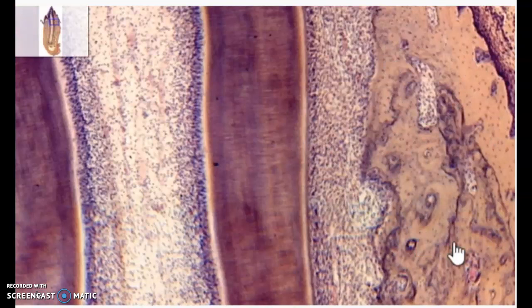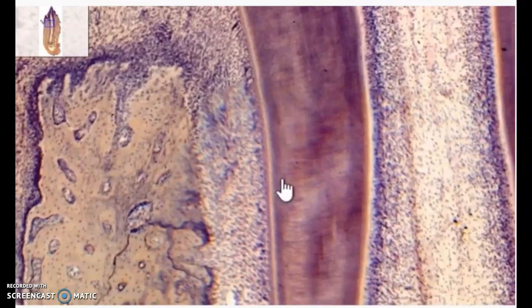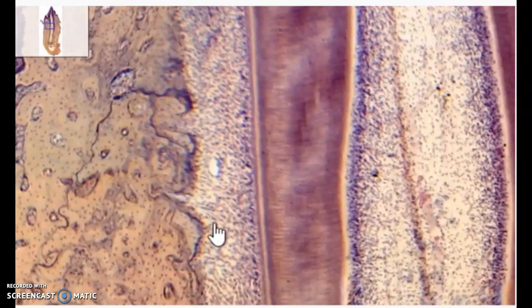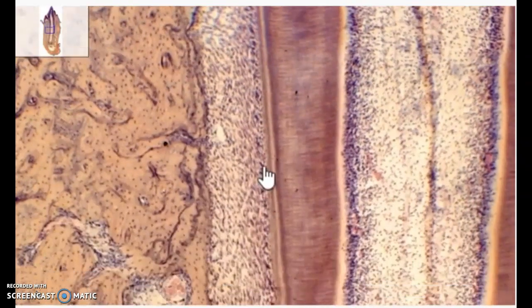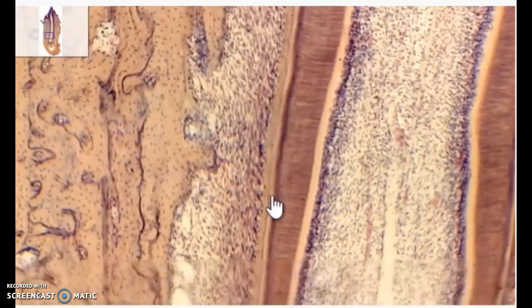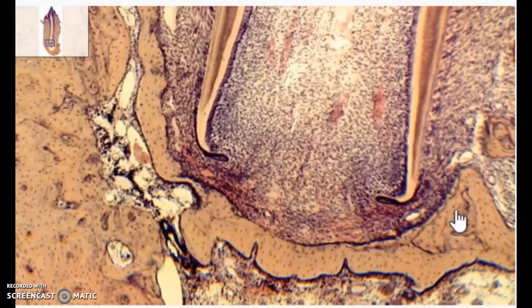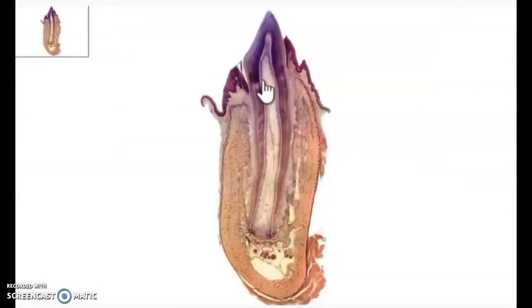They run from the tooth to the bone, and this is going to be the actual bone where the tooth is anchored into. So you have the tooth on both sides anchored into this structure, the bone, from ligaments, which are your periodontal ligaments, and cementum helping to hold it in place. All the way down to the very tip. Can you see the bone encased around the entire tooth cavity here? So this is a slide of a tooth encased in the bone.